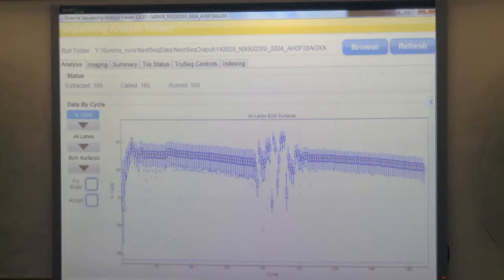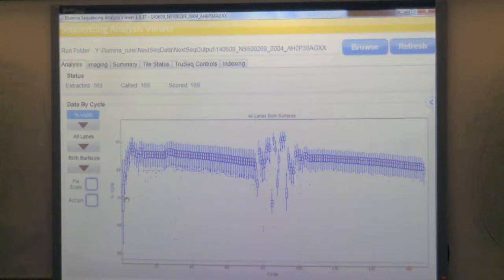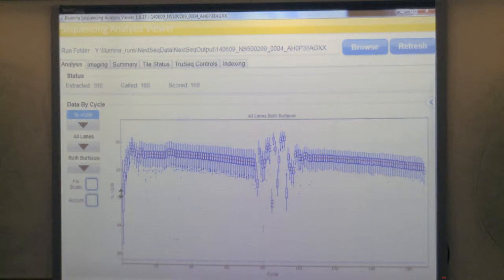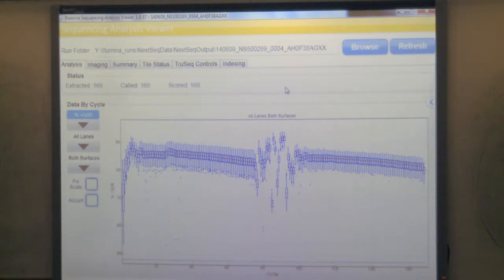Look at the very beginning as well. The run uses the first five cycles for calibration and focus, so it starts a little bit lower, but then it goes up. The first cycle is about 75% maybe, then it goes up. This looks like a good run - yes, definitely, it looks like a good run.